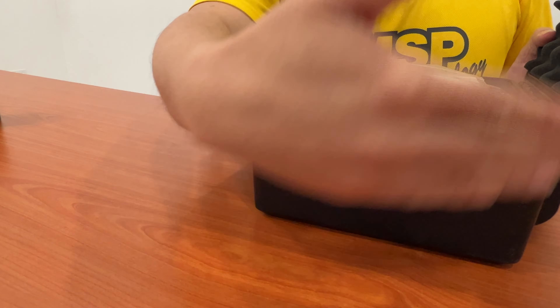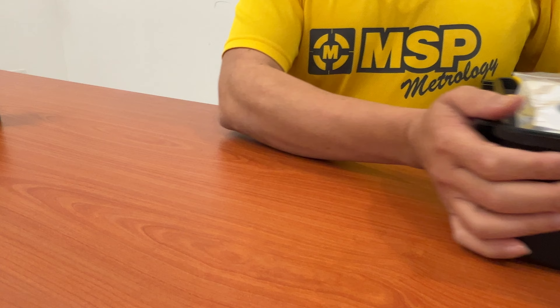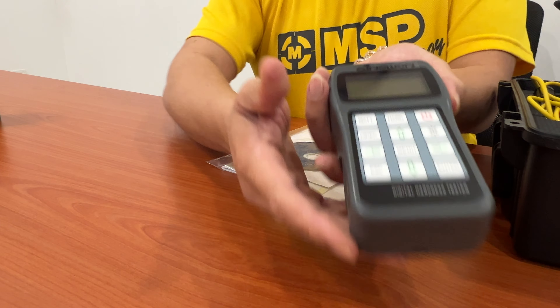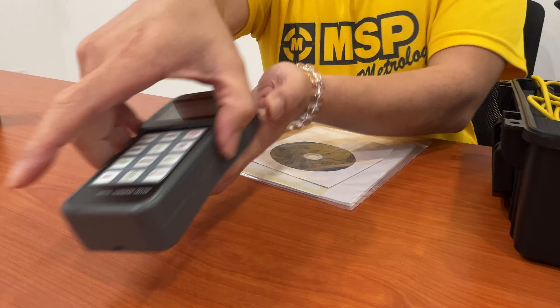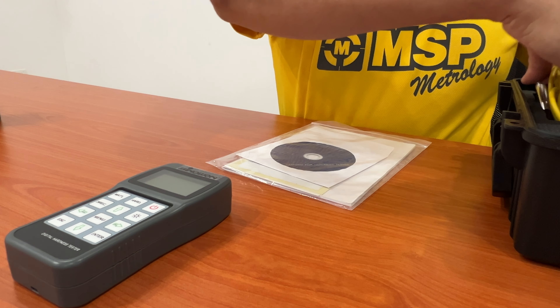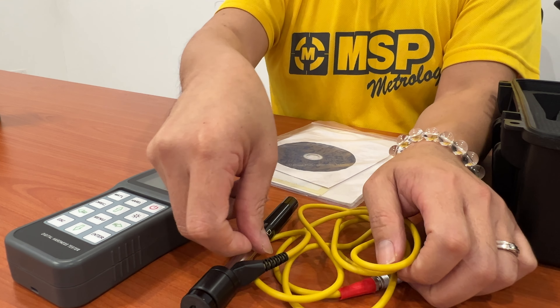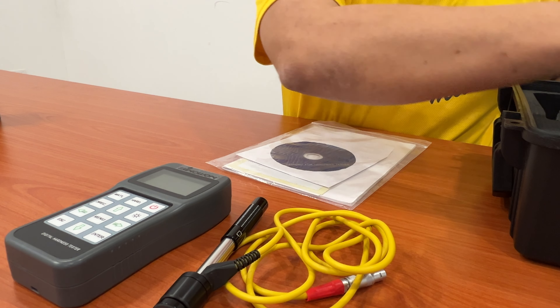In the package, you can see we have one hard casing. It comes with the main display unit and one probe — we call it the D-type probe.